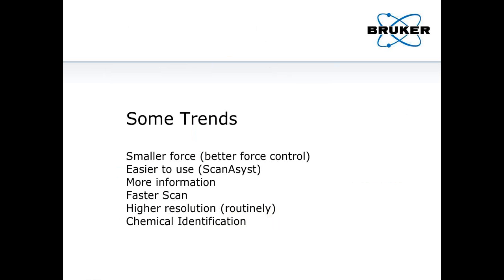Now I have shown you very briefly, but I hope I gave you a flavor of how AFM works and what kind of applications you can use it for. Now I want to touch on some of the trends.